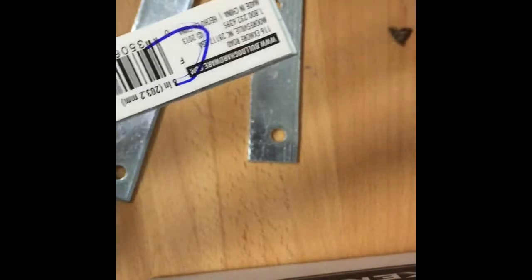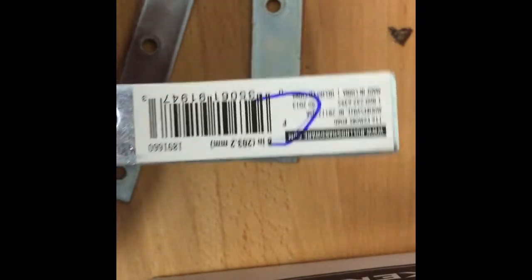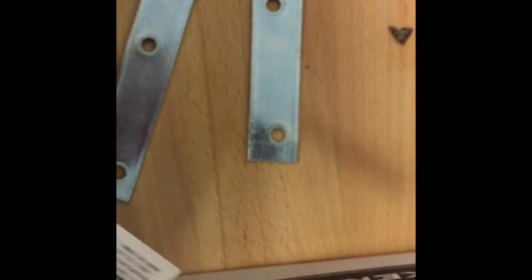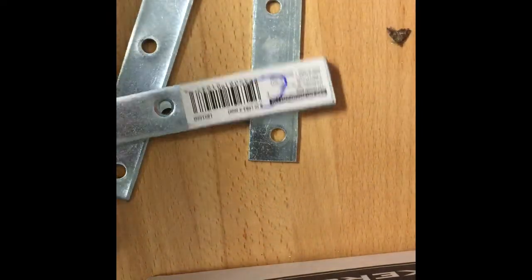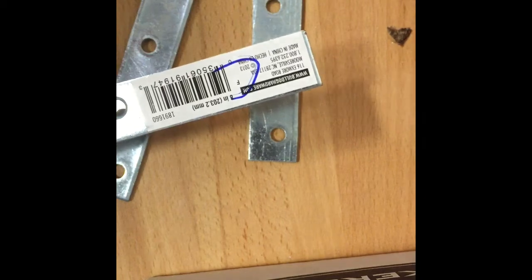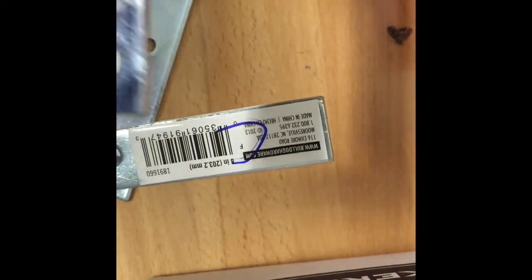C was the application of 3 parts of diamine and 1 part resin. Huh. Well, that's stuck on there. We'll go figure. By applying additional components of the diamine and less of the resin, we've given a lot more diamine to go and cross-link with the little bit of resin that was there. Huh. Maybe it's not stoichiometrically balanced then. Or maybe I did this one wrong. That turns into a question.